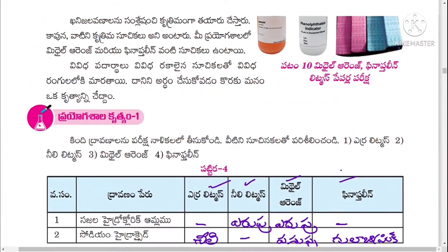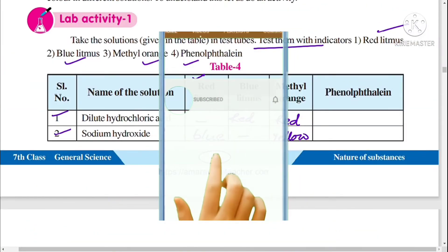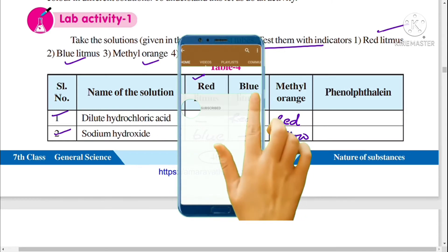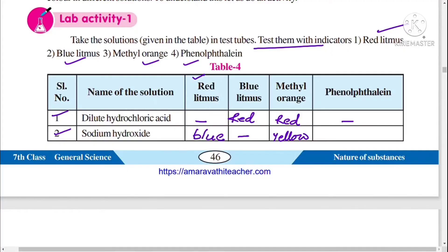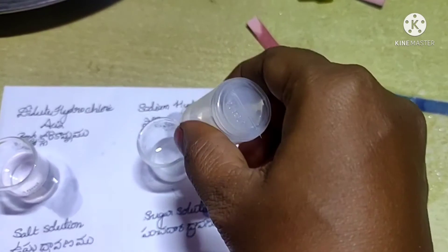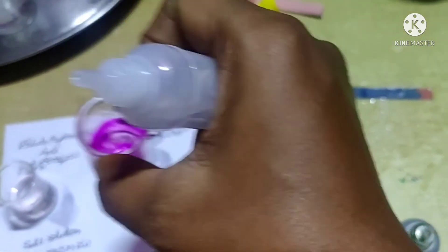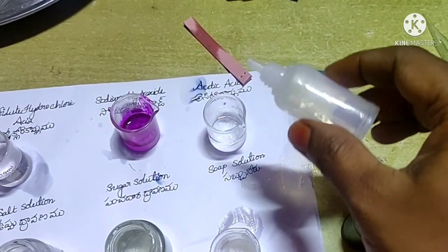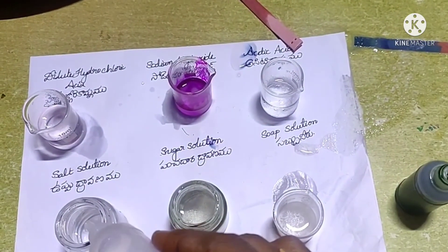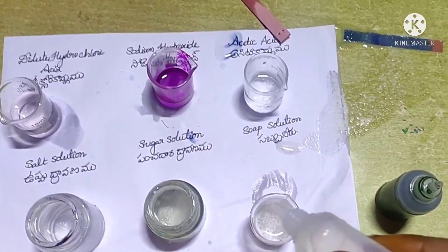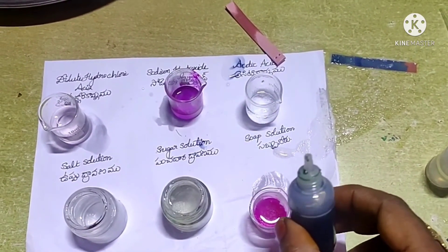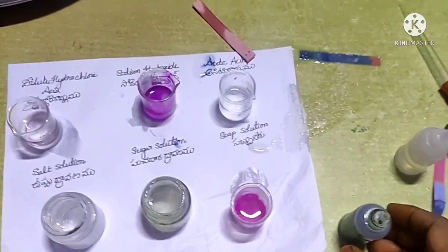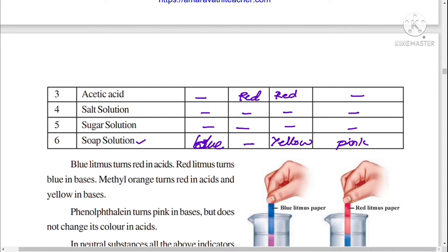The next indicator is phenolphthalein. Pour two to three drops of phenolphthalein solution into dilute hydrochloric acid — it does not change its color. Add few drops of phenolphthalein to sodium hydroxide solution — it will turn pink. Add few drops of phenolphthalein into acetic acid solution — it does not change its color. With salt solution, it does not change its color. With sugar solution, it does not change its color. With soap solution, it will turn pink. So phenolphthalein changes to pink color with base solution, but does not change its color with neutral solutions and acidic solutions.